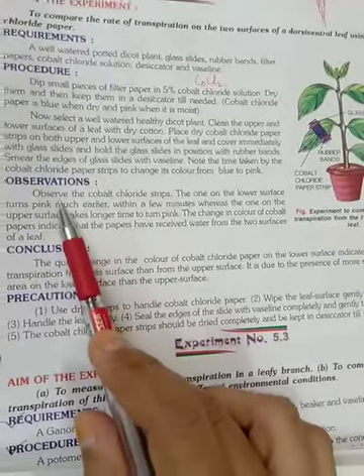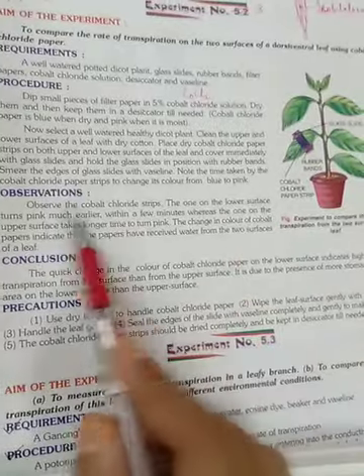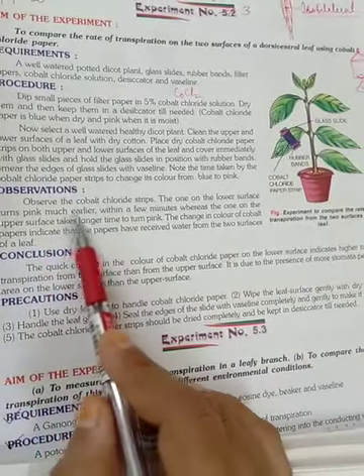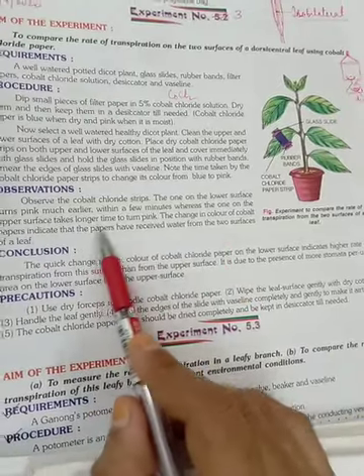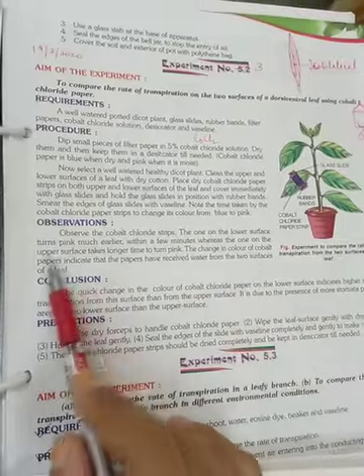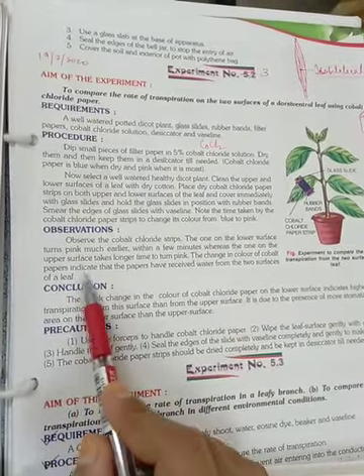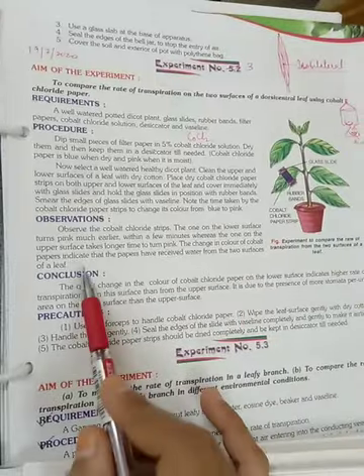Next heading. This will be the fourth heading. Observe the cobalt chloride strips. The one on the lower surface turns pink much earlier, within a few minutes, whereas the one on the upper surface takes a longer time to turn pink. The change in color of the cobalt papers indicates that the papers have received water from the two surfaces of a leaf.